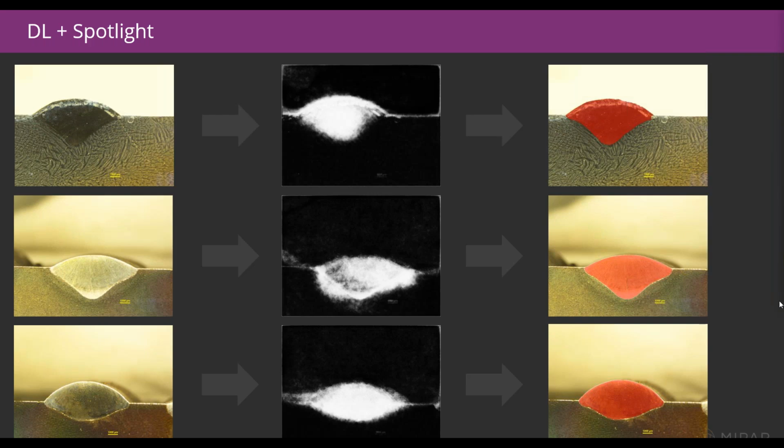Okay, very good question. So we do have a 3D extension to the MIPAR software, which allows recipes to be applied sequentially to the series of slices that then get stacked up to reconstruct your 3D microstructure. So it's primarily used for taking serial section data sets that have been captured either from a dual beam FIB-SEM instrument, where you have an ion beam that slices off layers of material, and an electron beam that then snaps a picture after each slice, sort of like a micro deli slicer with a camera on it.